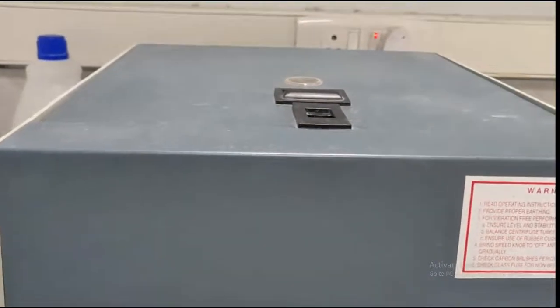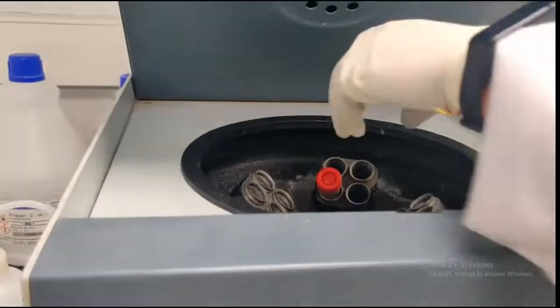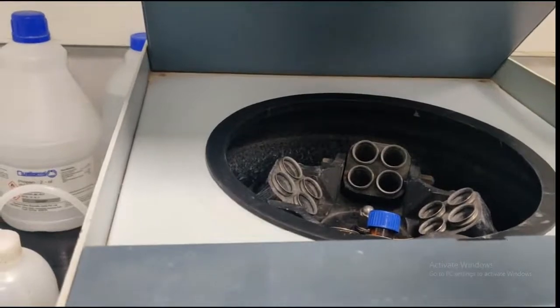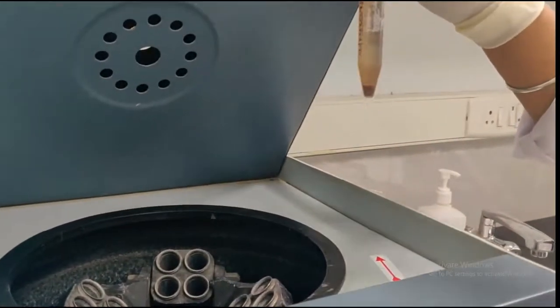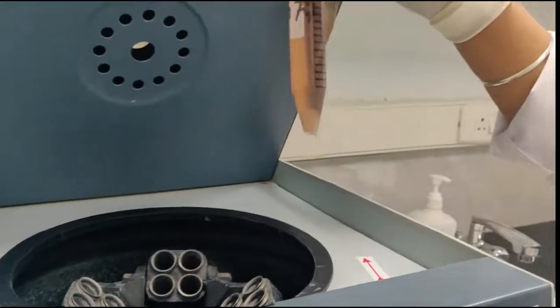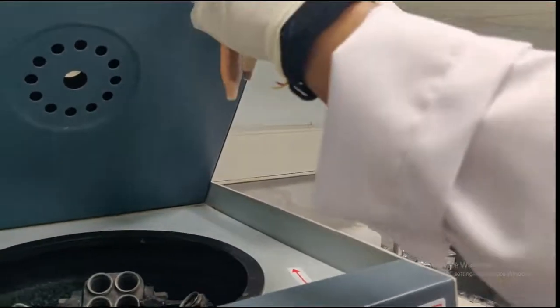So now the centrifugation is over. We will now take out the tubes. So the tubes have to be kept balanced in the centrifuge. So now we can see a nice pellet, an even nicer pellet has settled at the bottom of these tubes. So this is the effusion aspirate and this is the effusion sample, and a nice pellet can be seen.